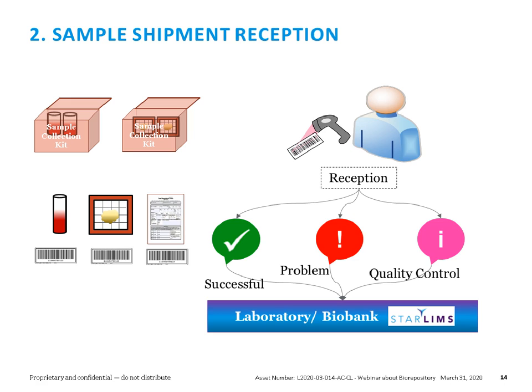And with problem samples, there could be also another category of quality control. I think this is also another option that LIMS should offer for the users as they are receiving samples, to be able to capture quality control data for the samples that they receive.